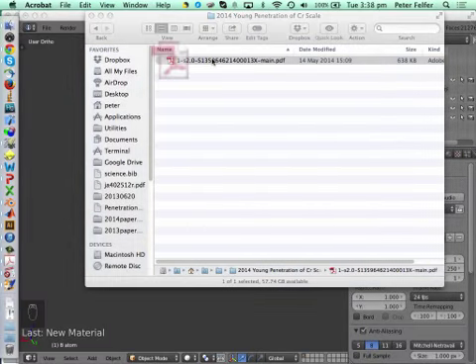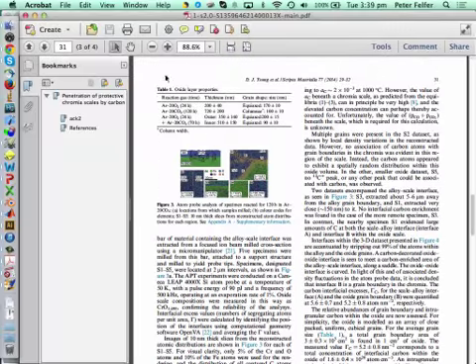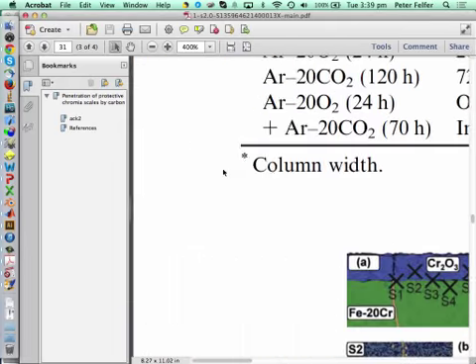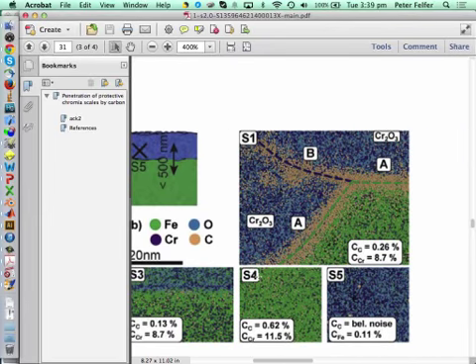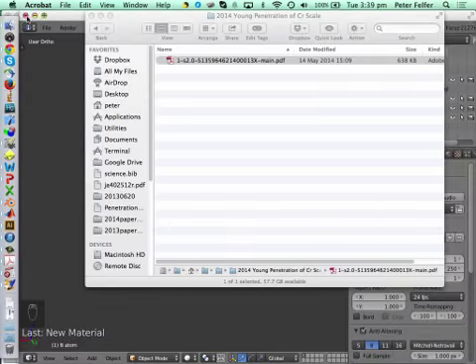So this is actually done with the halo material. If you want to give it sort of a cross-sectional flat appearance, I consider that a better option. If you want to make it look very plastic, you do it the way we just did it with the spheres. If you want to make it look more like this, then you use the halo material.